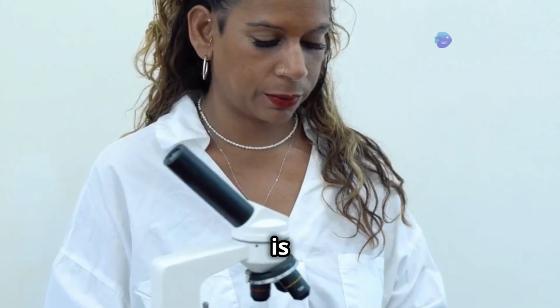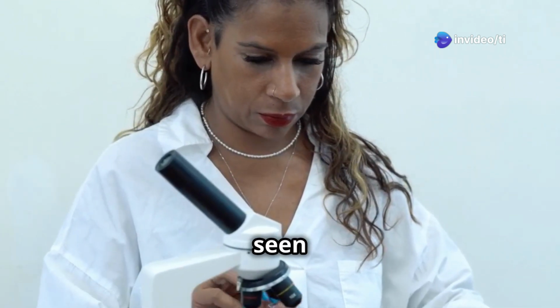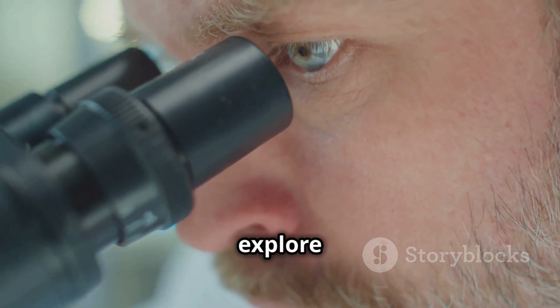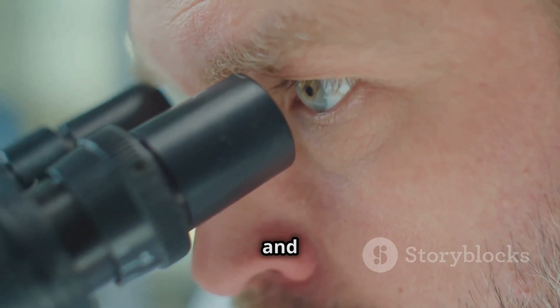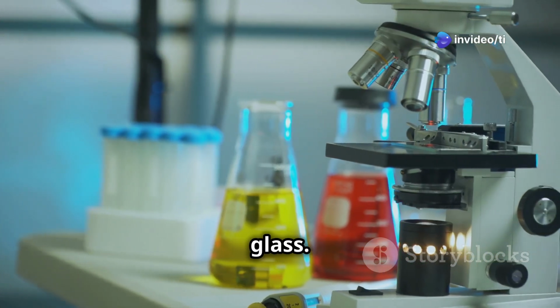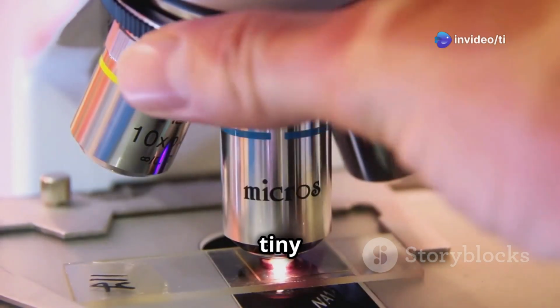A microscope is a scientific instrument that allows us to see objects too small to be seen with the naked eye. It's like having a superpower, allowing us to explore the intricate details of a hidden universe teeming with life and wonder. Think of a microscope as a powerful magnifying glass. It uses lenses to bend light and create magnified images of tiny objects.